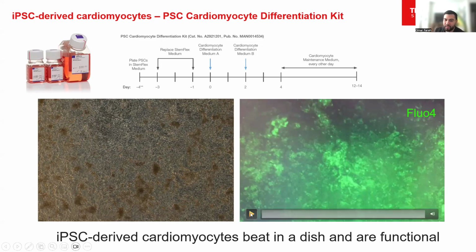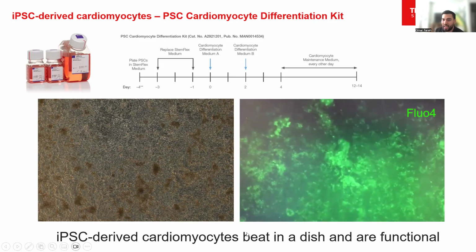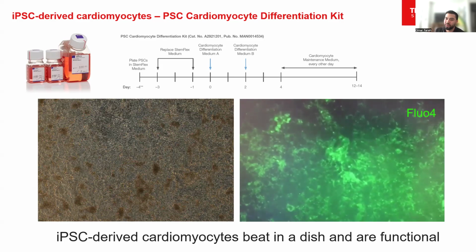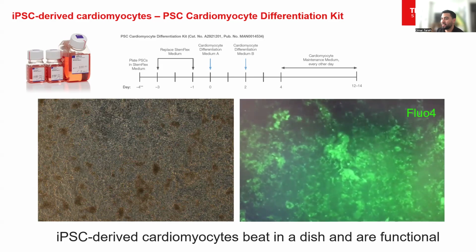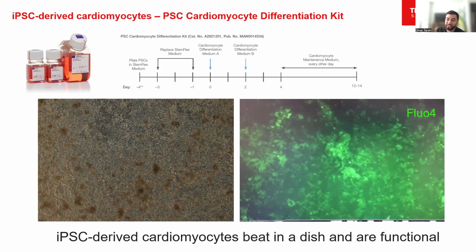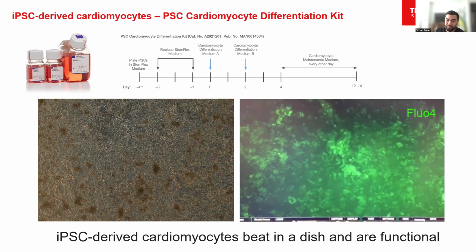But we can also look at some of the intracellular signaling that we know happens in these cardiomyocyte cells in general, mainly this influx of calcium into the cell. And we can track that with different dyes. This is just an example of one of those dyes, a fluorophore. And you can see how we have these firing bursts that coincide with when these cells are contracting, right? So we can start to analyze how these cells function and relate that to us deriving them from our pluripotent stem cell populations.